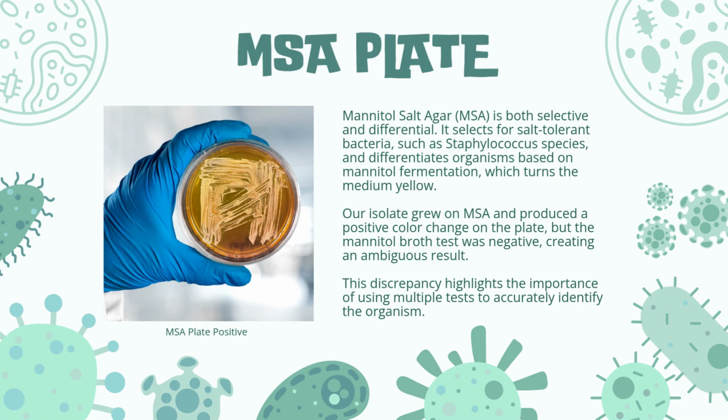On MSA, my organism grew well, as expected for Staphylococcus, which tolerates high salt concentrations. The medium showed what initially looked like a positive reaction, but when compared to the mannitol broth results, it became clear that the slight color shift was not due to mannitol fermentation.